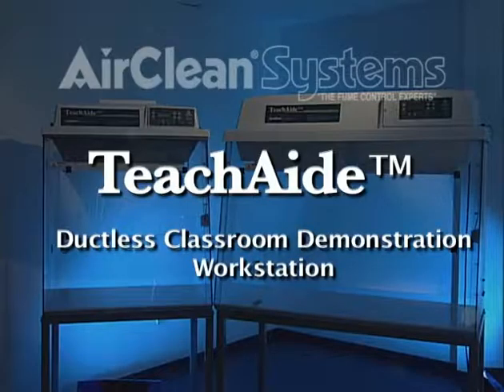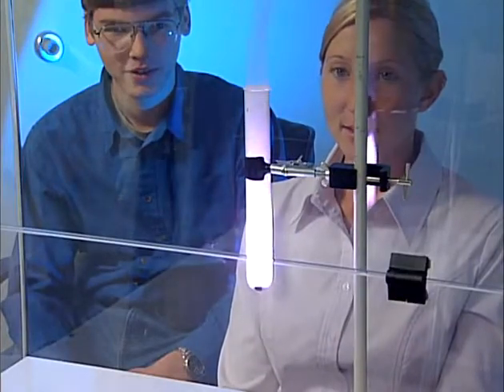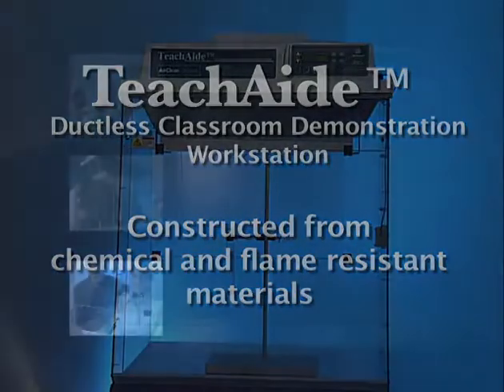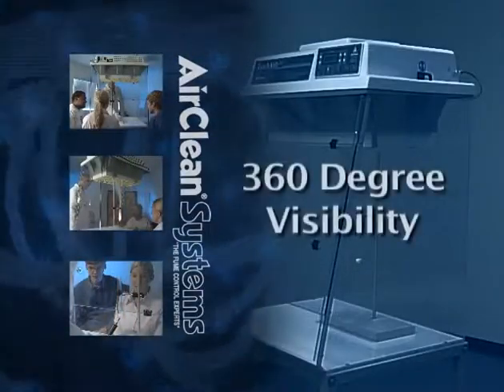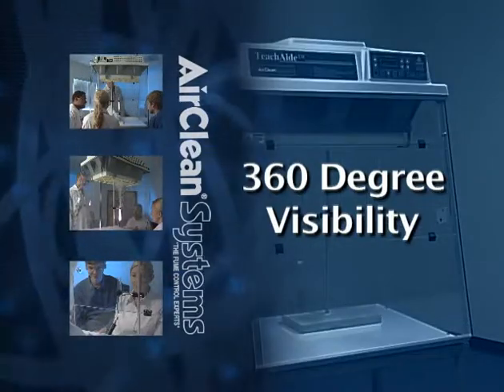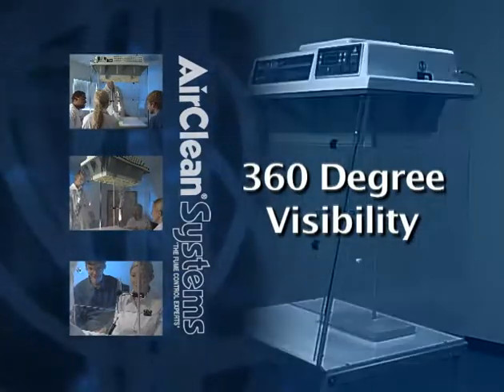TeachAid ductless classroom demonstration workstation provides a safe and effective work area for typical hands-on science demonstrations. Constructed from chemical and flame-resistant materials, TeachAid is the ideal workstation for the classroom. Sturdy design and 360-degree visibility provides for easy observation and allows the educator to monitor the class more effectively.